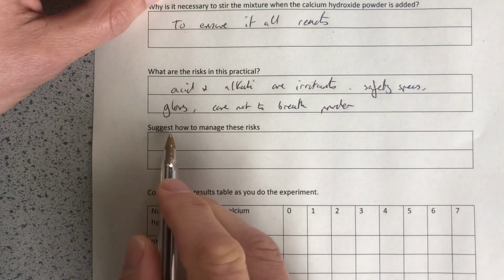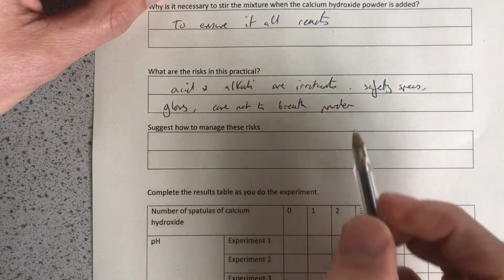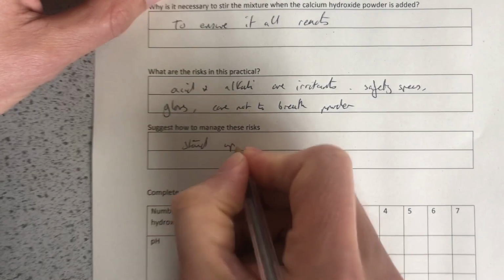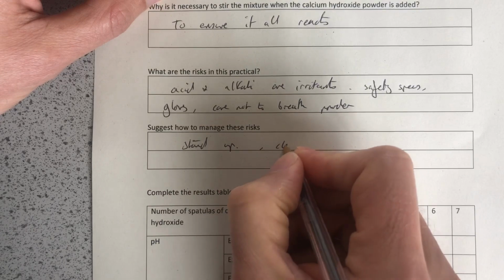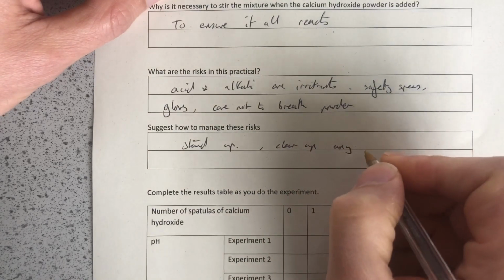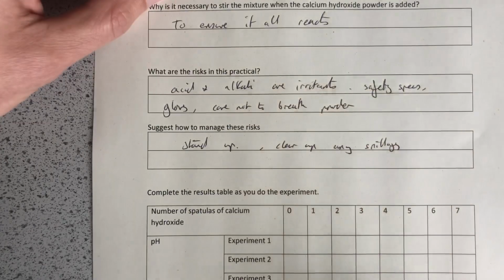So I've added the management to the risks, to the fact that they're irritants, up here. We're also going to stand up. We don't sit down to do practicals. And we're going to clear up any spillages. Often students spill a bit of powder on the desks. We're going to clear up any spillages straight away. And there are probably others that you can think of as well.